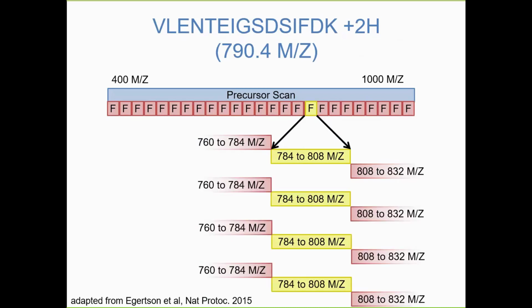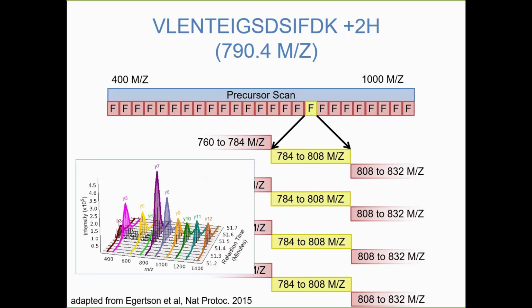But with DIA, we actually acquire this data regularly in a repeated fashion. So instead of measuring one fragment ion scan, we're measuring it across time. And we can see, as a result, the shape of the peak, because all of these fragment ions should rise and fall with each other. And if they don't rise and fall, then that indicates some kind of interference, or it indicates that those fragment ions don't actually belong to the peptide we're interested in looking at. So this makes it clear what data we're looking at.